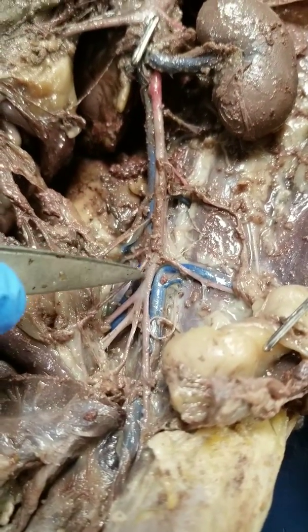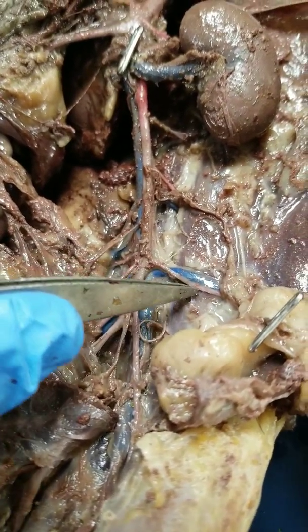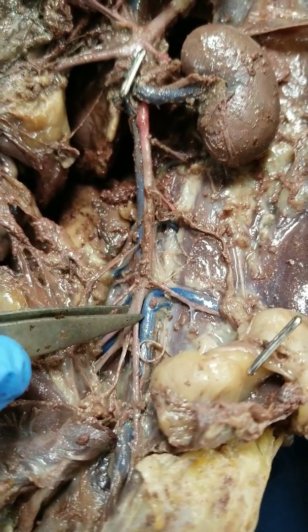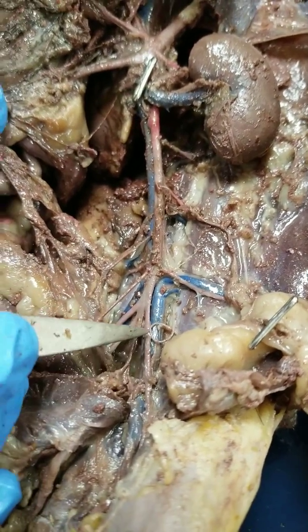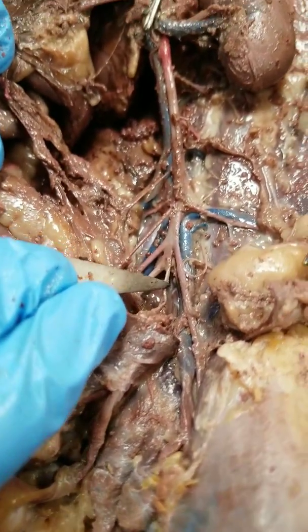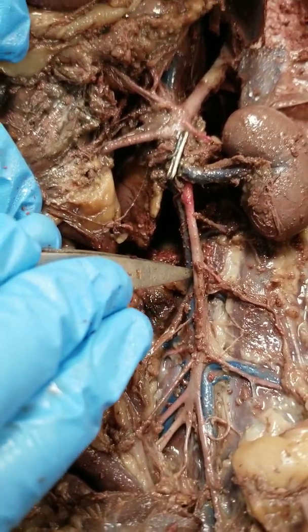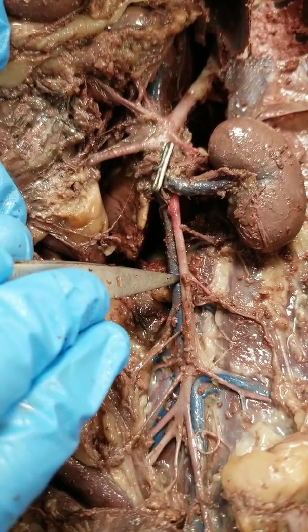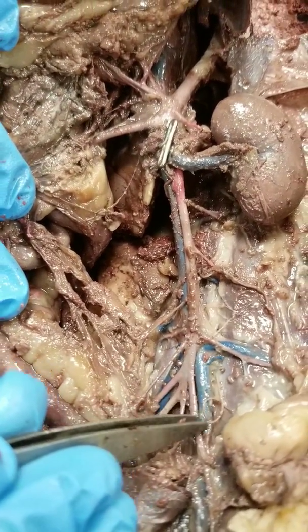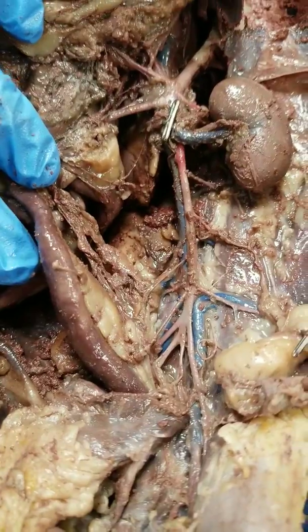Continuing down, this red artery is the inferior mesenteric artery that supplies the large intestine. This one going out into the lumbar area is the iliolumbar artery. Branching off the aorta, we have the external iliac artery, which becomes the femoral artery in the leg, and the internal iliac artery. Looking at the inferior vena cava — which we can see underneath the heart and also in the abdomen — it branches into the external iliac vein, which becomes the femoral vein in the leg. Those are the arteries and veins of the mink that you're responsible for.